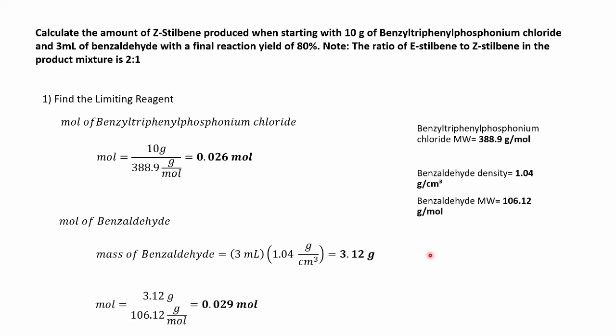We can then divide 3.12 grams by the molecular weight of benzaldehyde, which is 106.12, and this leaves us with 0.029 moles.